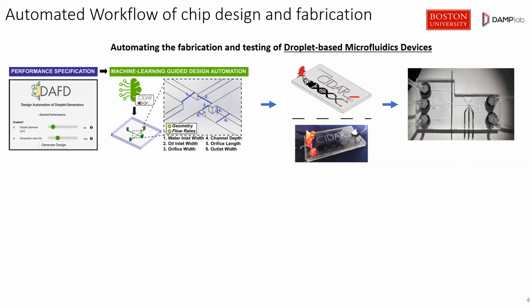And then finally, you get this very nice device. Now, of course, it's not that easy to get a very pretty device like that. There are many iterations, but that's the beauty of this type of framework, rapid prototyping. The techniques and materials that we use allow us to fail fast and just move on until we get something like this in a matter of a week.